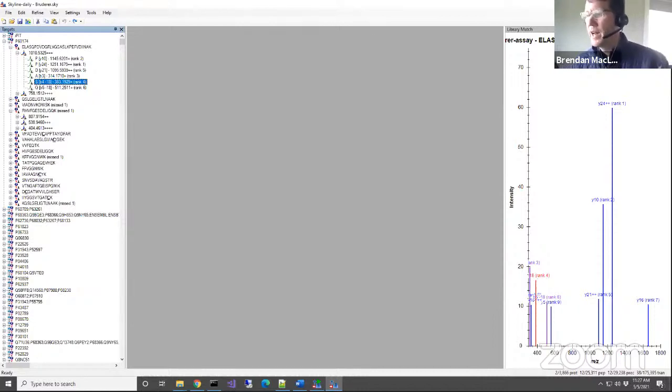So as we showed yesterday, we have extensive support, and the things we're missing are largely just things that have never been asked for. I can't think of a spectral library format that somebody has asked us to support that we have not supported. So, okay, DIA-NN does not work. So please help us out by giving us examples, because we don't run DIA-NN. So we're going to need examples, and then we can adapt the software to support it.